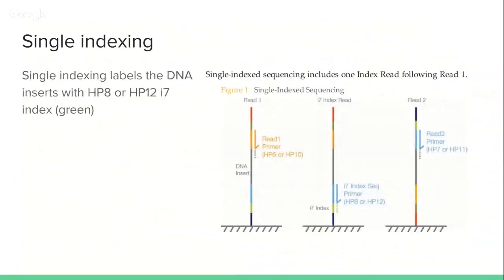Single indexing reads work like this. Essentially, there's a part which is your DNA insert. That's what the biological sample contains. And then there are a series of additions that Illumina uses to basically classify your molecule, your set of molecules in a multiplex sample. This works great because it allows you to tailor your sequencing run, put as many samples as you need to get the expected throughput rather than having to have too many reads from a single sample.